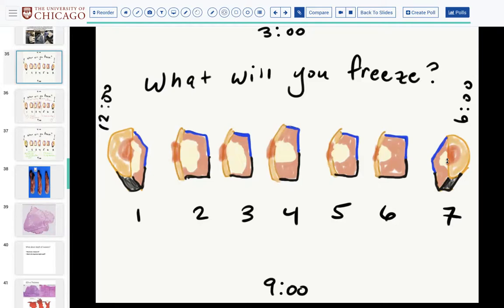and show it to them, maybe cut it, process a few sections with Ryan, and see how the permanent histology comes out after freezing. Because I think that's the gold standard, right? If you freeze it and thaw it and then submit sections from that, what does it look like? So yeah, I would try it out. I'm happy to look at the stuff with you. I'm curious. So yeah, I support a trial of that.